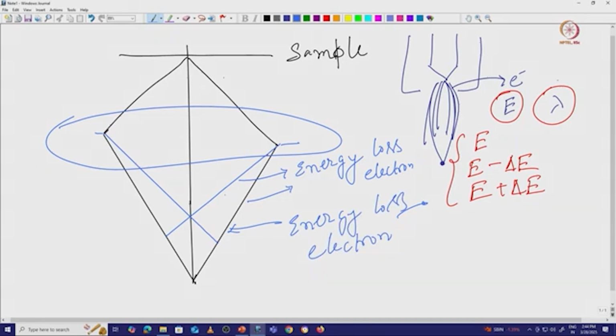Okay, so here you can see that this angle is very important because it is called beta. And here this is the image plane, where we can get the actual image. This is the actual image plane.